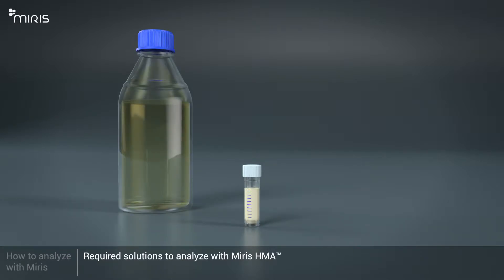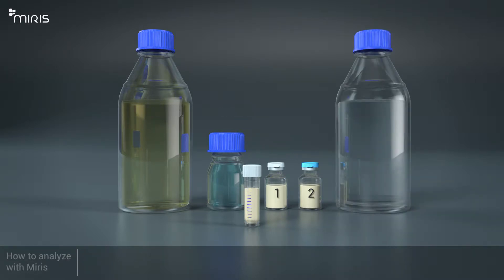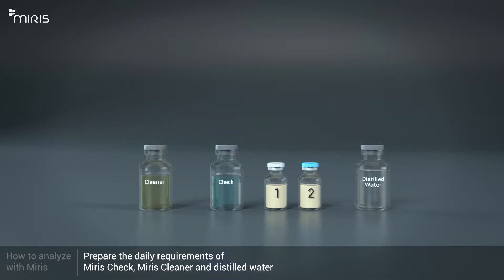These are the required solutions to use with the Meris Human Milk Analyzer: Meris Cleaner, Meris Check, Meris Calibration Control, and Distilled Water. Prepare the daily requirements of diluted Meris Check, diluted Meris Cleaner, and distilled water, and pour the solutions into smaller bottles for easier handling.